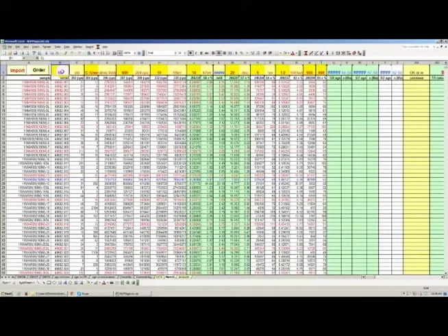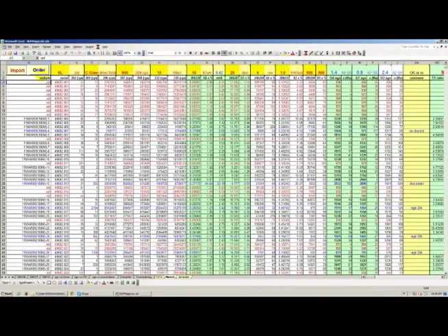And then what the macro is going to do when you click on order in a second is go down column A, looking into each one of these names, and all of those that have an SL are going to be replaced by standard. So let's do that. Hit order. Okay, great. Now all the standards were identified. If you go to column U and column W, it's going to show in red the ages for the standards, the 6-8 age in the U column and the 6-7 age in the W column.